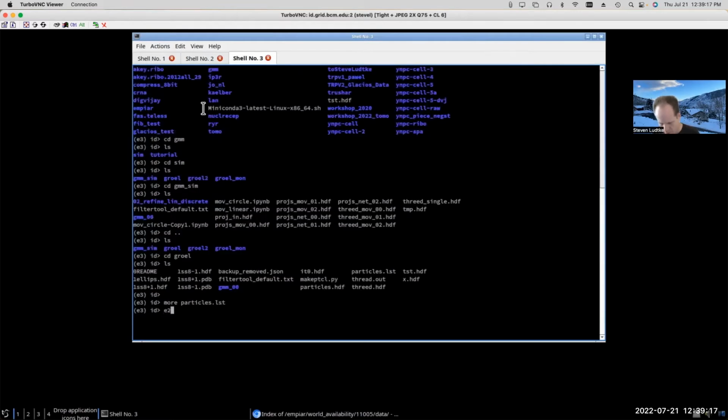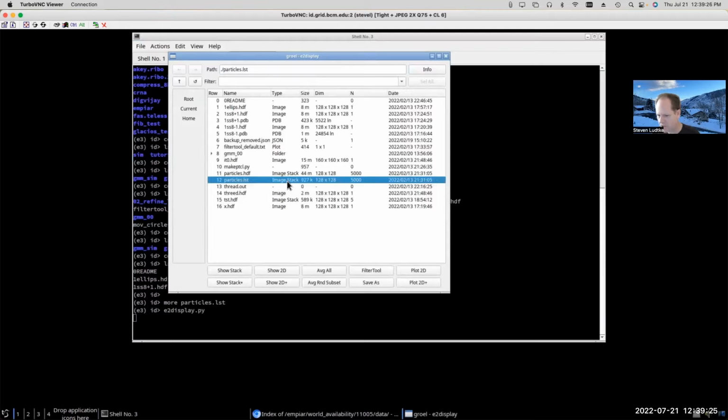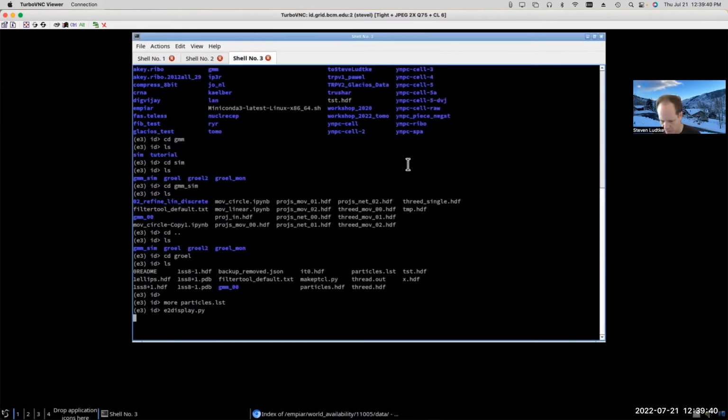So if I run E2 display here, it sees that particles.lst file as an image stack file, even though really it's just a text file. Okay, so EMAN treats these LST files as if they contained actual images, even though really they're just text files which contain references to images.